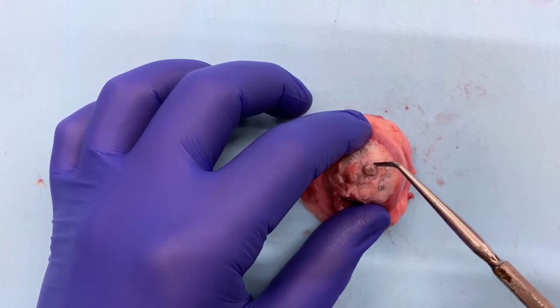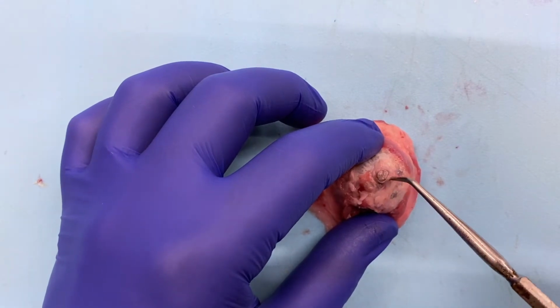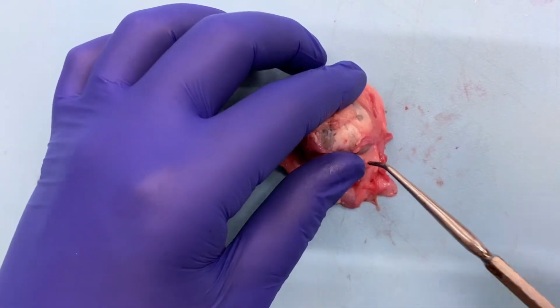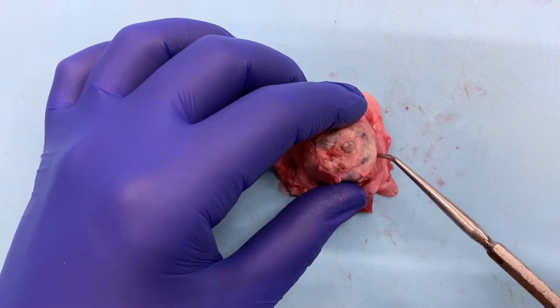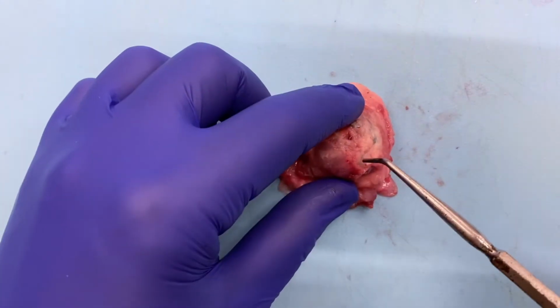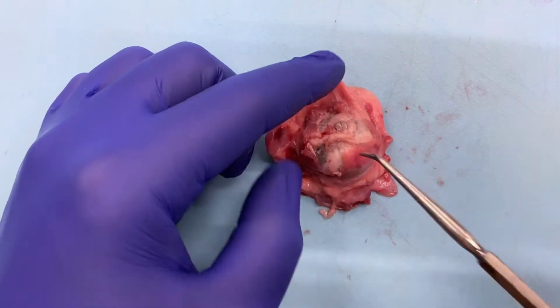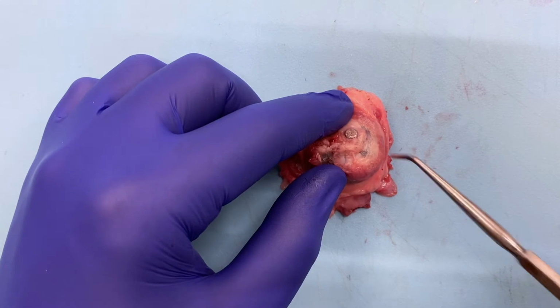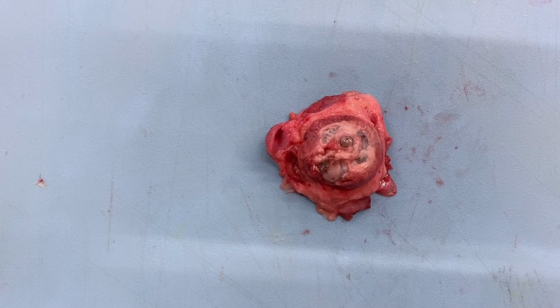Additionally, you can see the optic nerve here. It's kind of blackened in this particular specimen, and when we look at prosection, that'll become important. And then let's see if we can find our inferior oblique muscle. It looks like it might actually be this guy here. So we've got medial rectus, lateral rectus. Yeah, it looks like oblique, and then inferior rectus down here. Inferior medial. So again, if those muscles are present, you can try to use them to orient your specimen, but oftentimes when you get the enucleation, you won't see those.